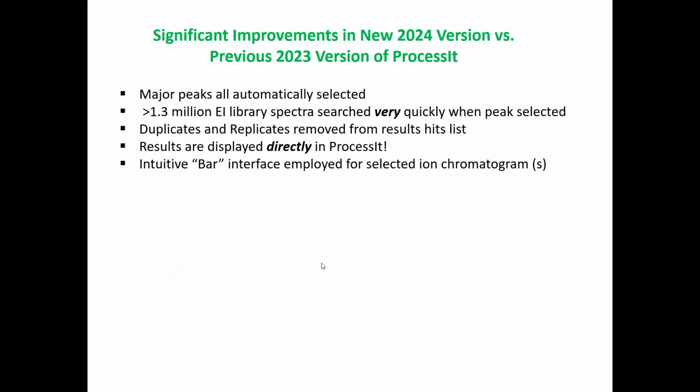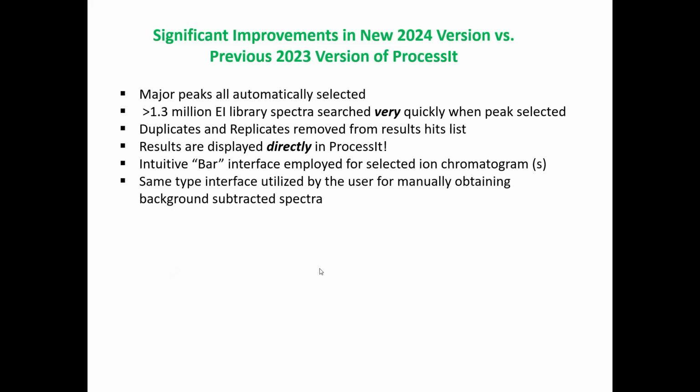An intuitive bar interface is employed for selected ion chromatograms, and the same type of interface is utilized by the user for manually obtaining background subtracted spectra. There's also some nice area determination software present within the application.